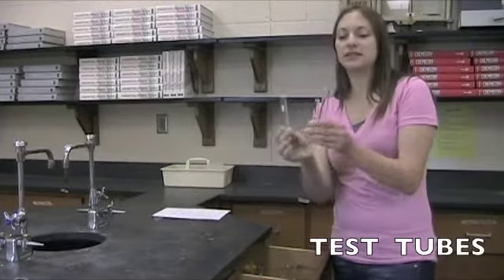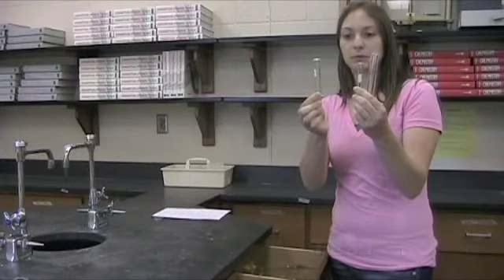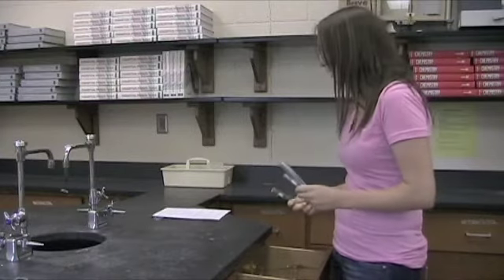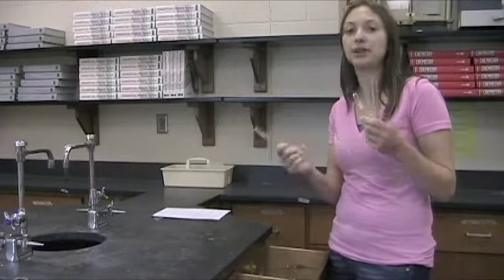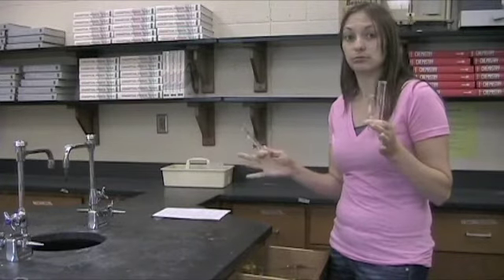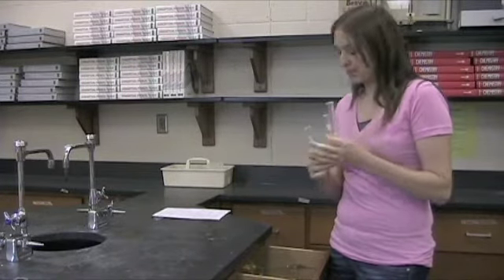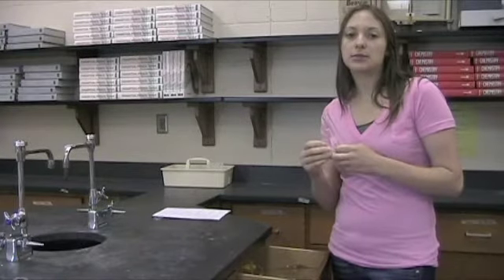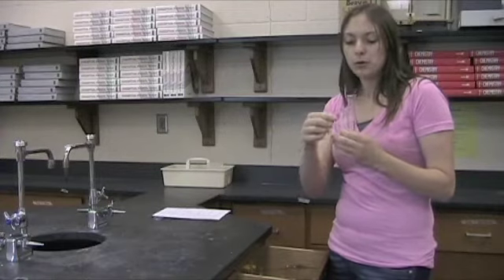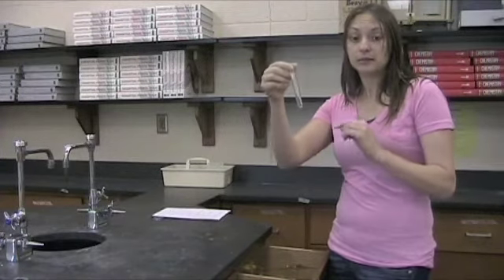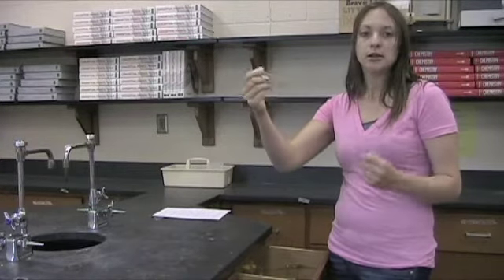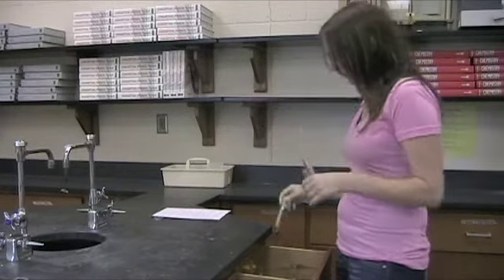We're going to use three main different sizes of test tubes. There are many others. We're only going to use these three. Small, medium, large. Test tubes can hold all kinds of liquids. They can hold solids. Kind of whatever you want them to do. You can put stoppers on top of them and you can shake them, with a stopper of course on top. Or you can, if you want to shake something in a test tube, you can just flick the bottom of it. And that'll kind of shake it up a little bit. So, test tube is something we're going to use all the time.